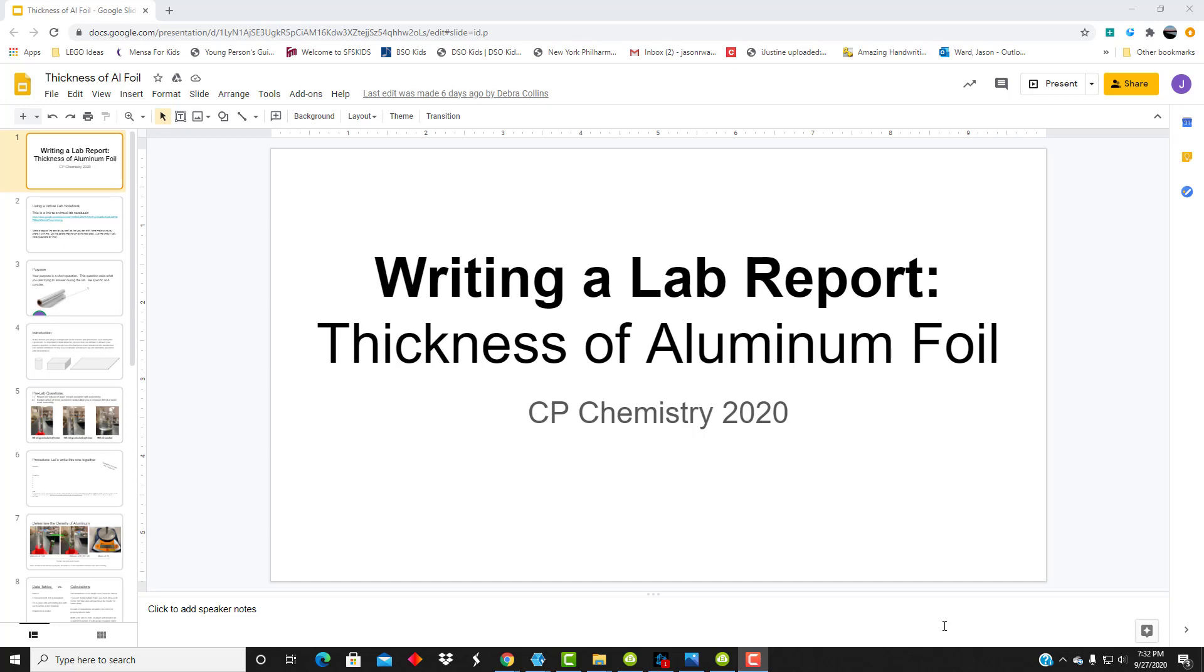This year, we're doing the lab notebook digitally, and some of the labs will be done digitally as well. So I'm going to walk you through the first few steps of setting up your lab notebook so that it's ready to go, and then we will walk through the first components of actually doing a lab, writing the report along the way.